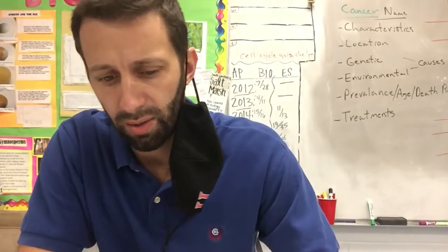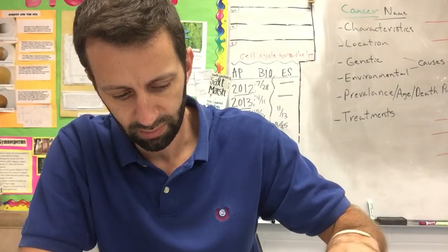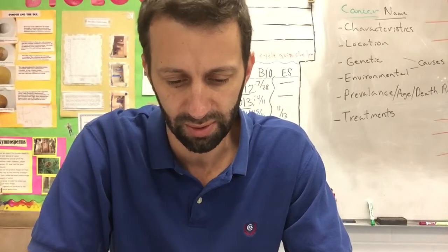On the soil lab, you're going to make sure you don't have any leaves, sticks, twigs, bark, or any of that kind of stuff. It needs to be the underlying soil that you can actually use.